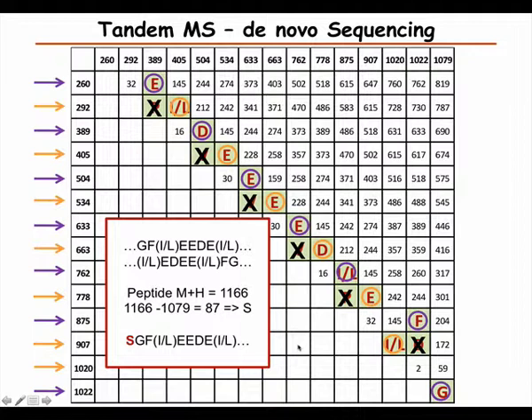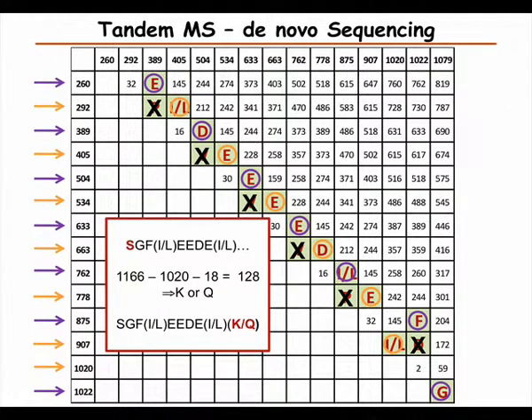That's how it works for the B ions. But for the Y ions, you have to add water also, like this. So that's why we know that.